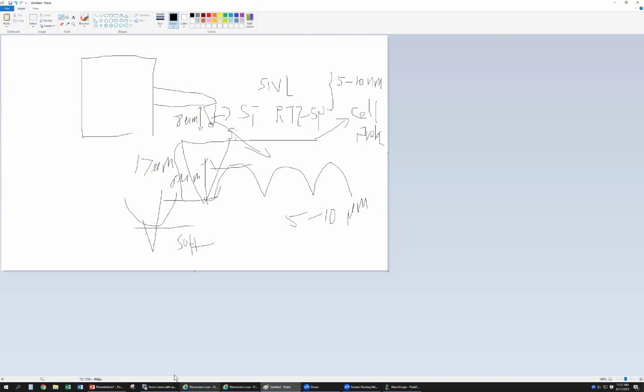That's why we have the probe dash 125, right? If it is even softer, even this 100 nanometer probe cannot be used. You should get a bigger one. The bigger one is called the small ball probe.